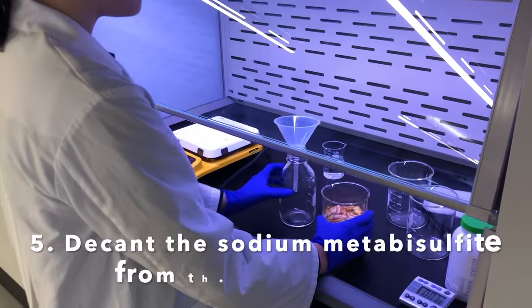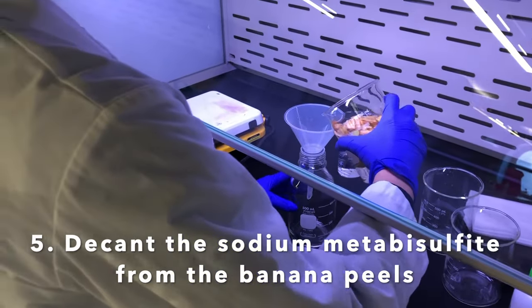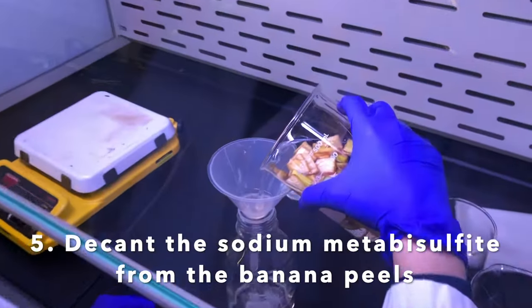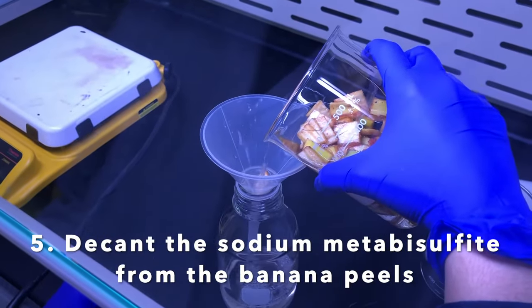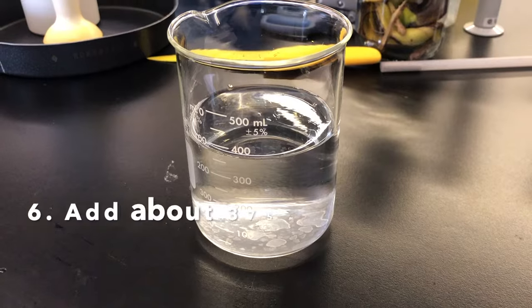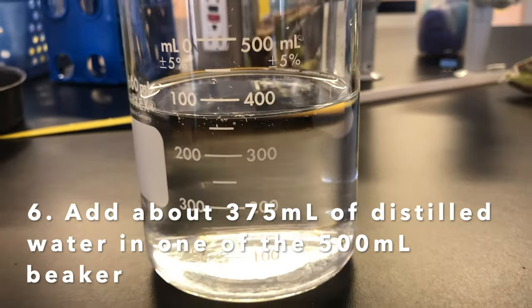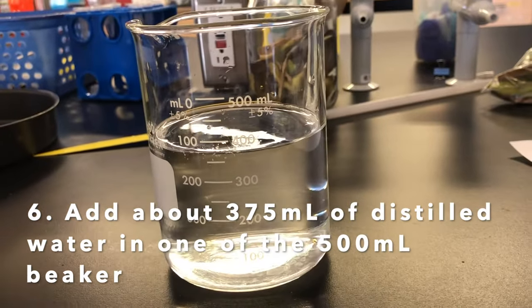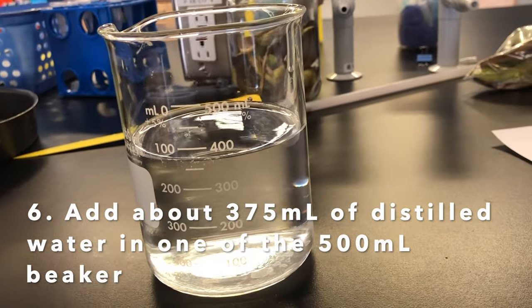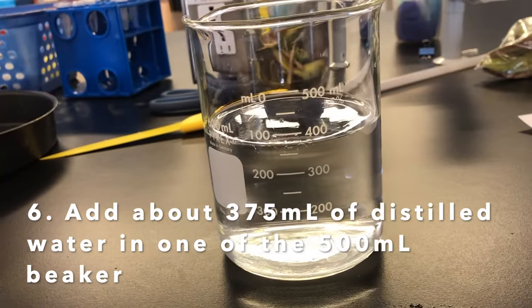For this step, Amagi is going to decant the banana peels from the Na2S2O5 with the funnel. Now we've added about 375 milliliters of distilled water, which is just enough to submerge your banana peels and let them boil with the water for 30 minutes.